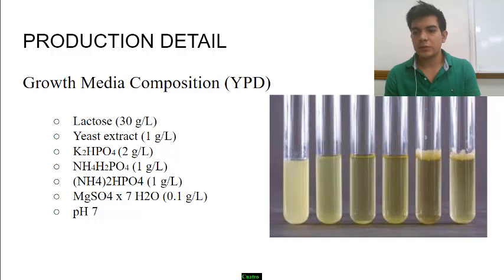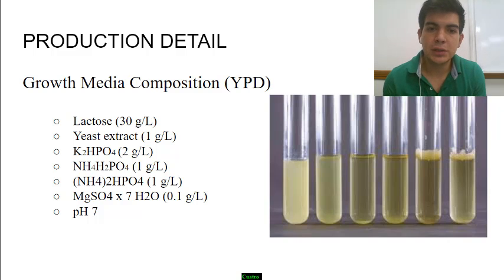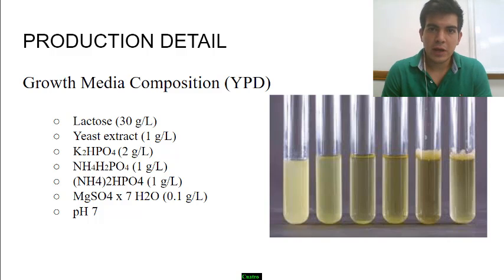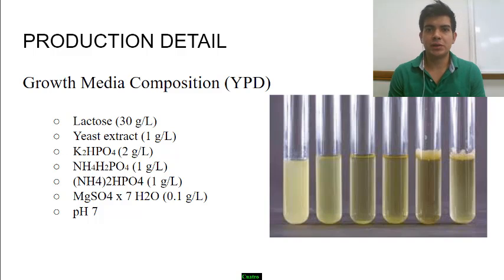What is a bioreactor? It's a manufactured or engineered device or system that supports a biologically active environment. In a bioreactor, it involves chemical processes which are carried out by the living organism or by biochemically active substances that are derived from the organism.